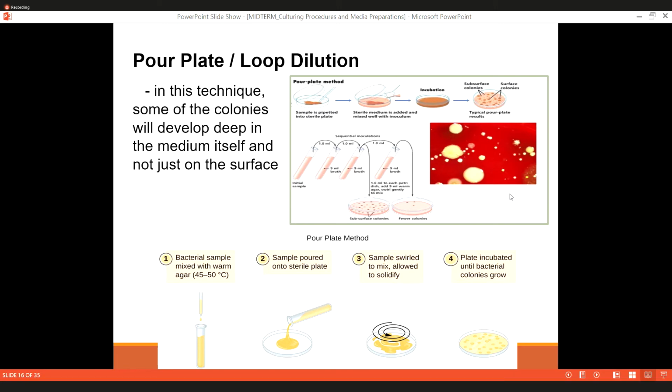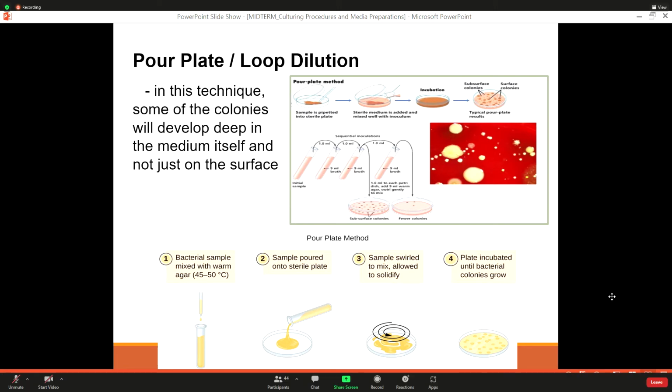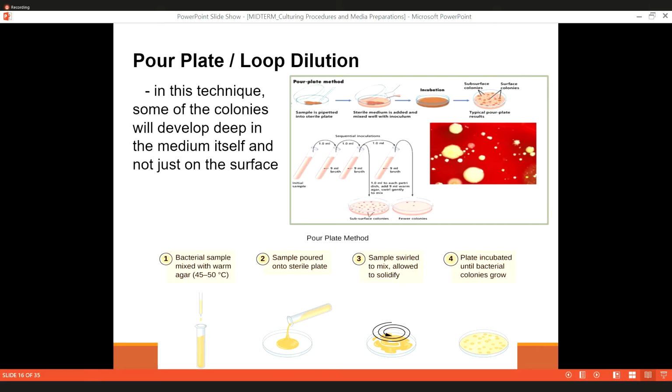Class, you will have significant results. It's more measurable, because we cannot measure the number of microorganisms present there in terms of their different concentrations just by looking at it, right? So, to make our data reliable, significant, and measurable, we're going to plate that.